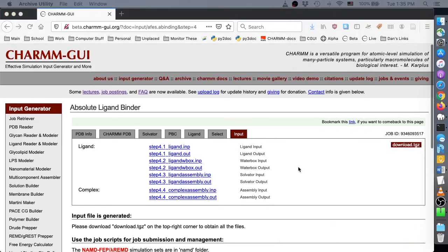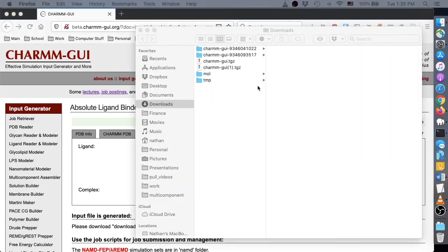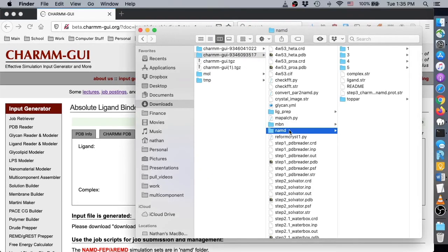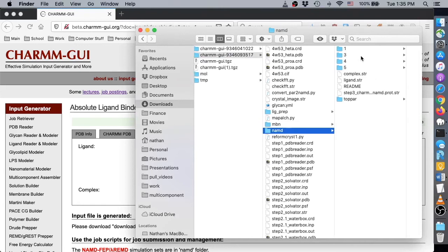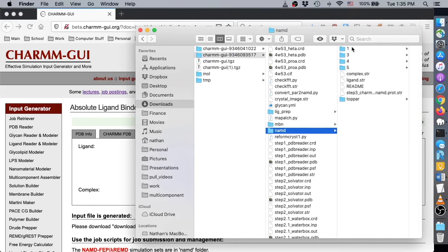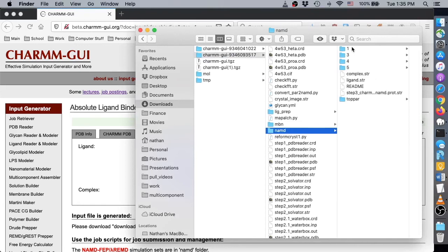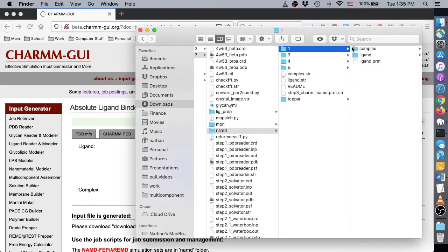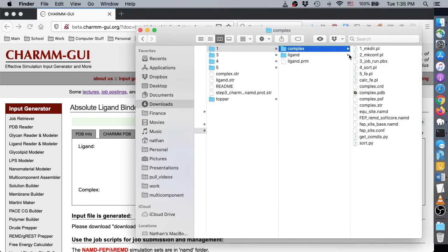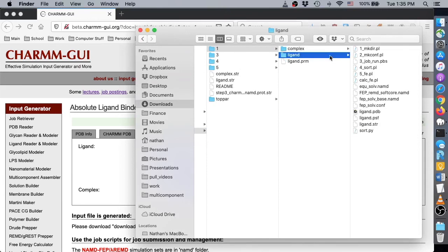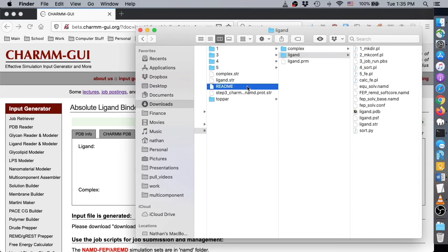In the downloaded project archive, notice that there is a number for each ligand binding system in the folder with your simulation package's name. Each of these subdirectories contains a complex and ligand directory, containing the protein ligand complex and ligand-only systems, respectively.